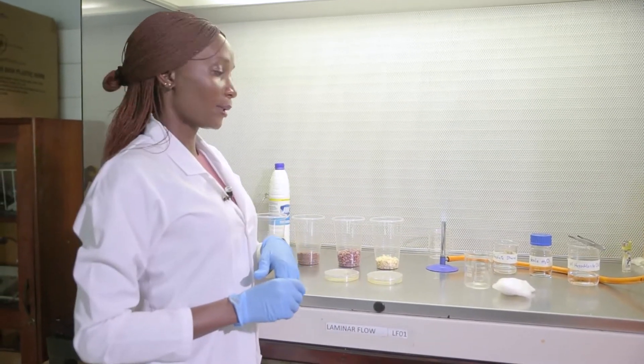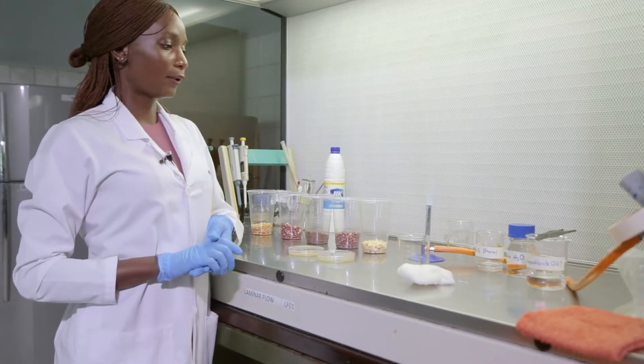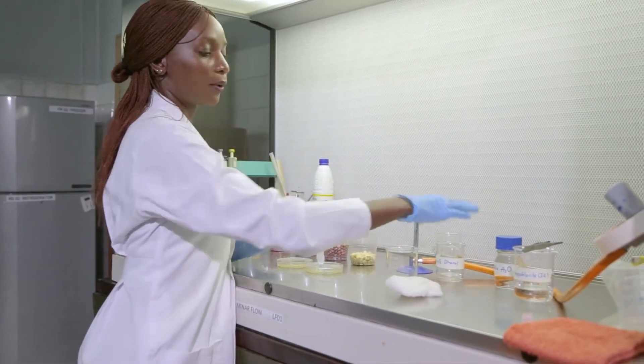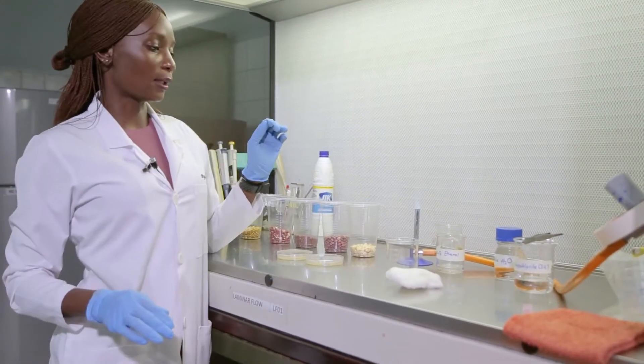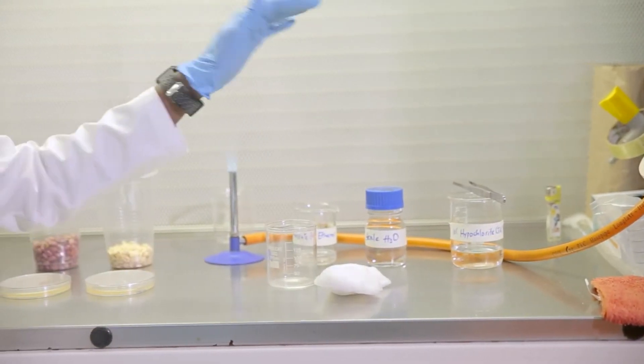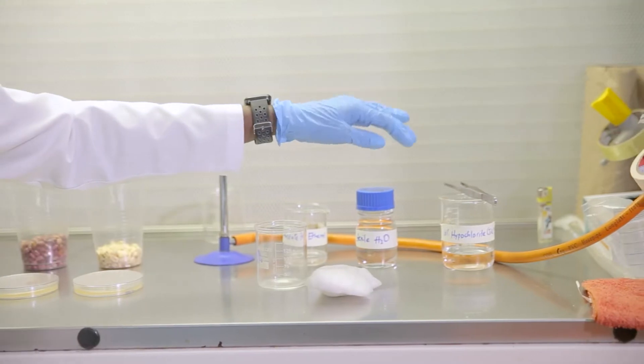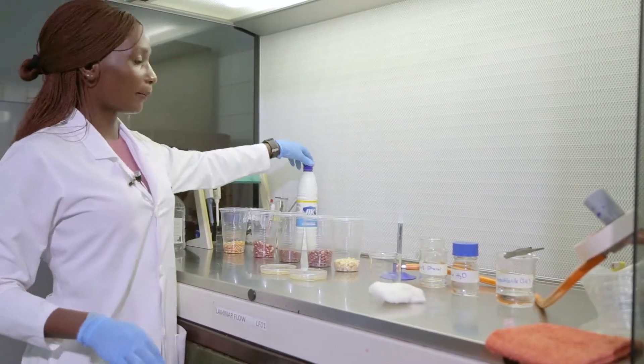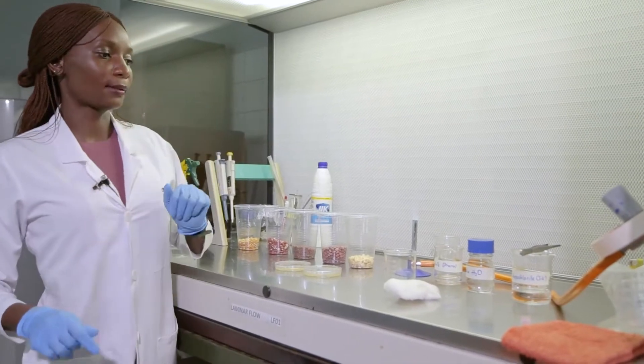The reagents that we are going to use are not many. This is actually a very simple test. We have absolute ethanol here, what we call concentrated ethanol. I have sterile water. You can use distilled water, it's okay. Then I also have 10% hypochlorite, or commercially what we know as JIK.